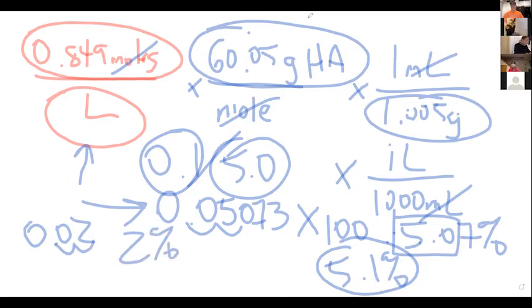That's a pretty good error. I will take 2% all day, especially when measuring with a syringe and everything else. So that's pretty good.